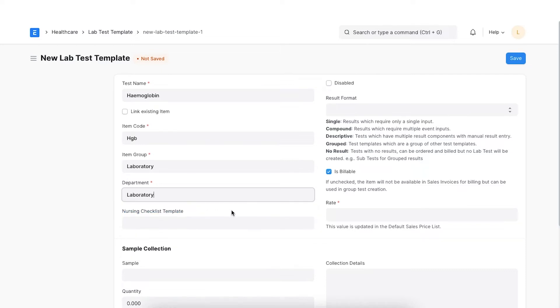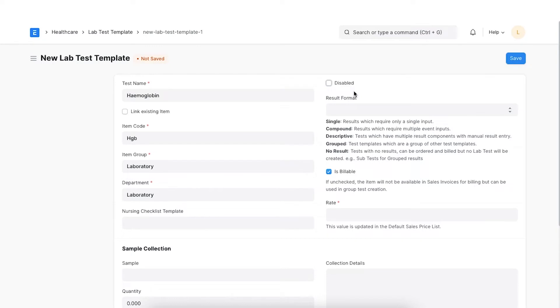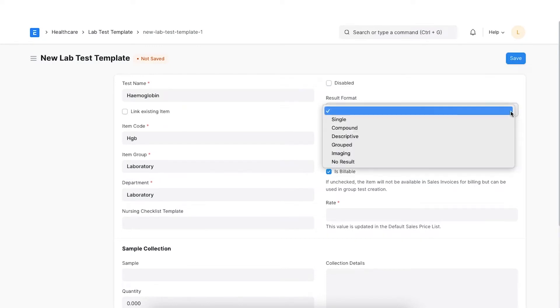We can disable the templates when they are not being used by checking the Disable checkbox. The linked item is also disabled on disabling a lab test template. Here, we will have to specify the result format for the lab test.